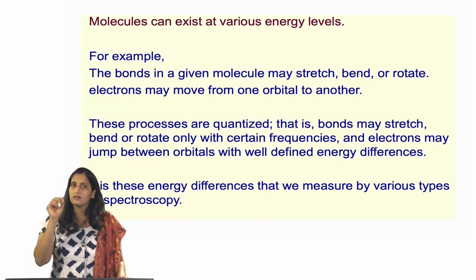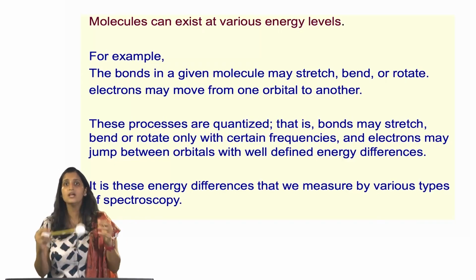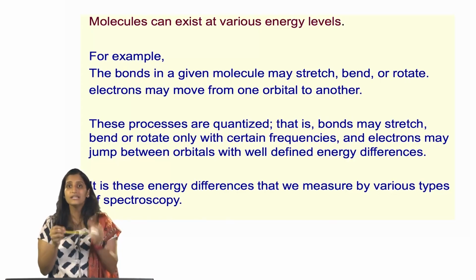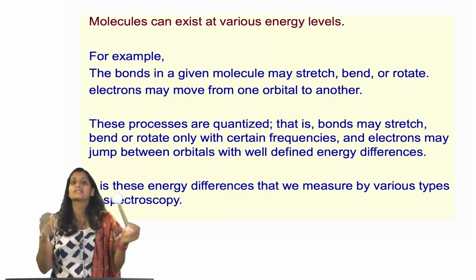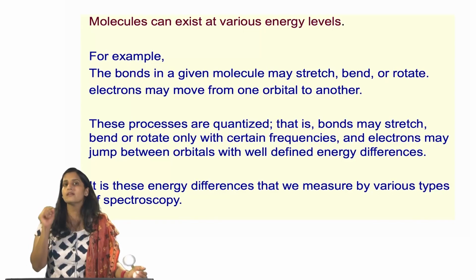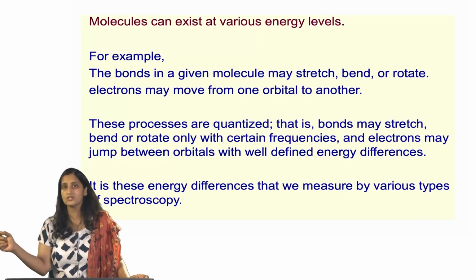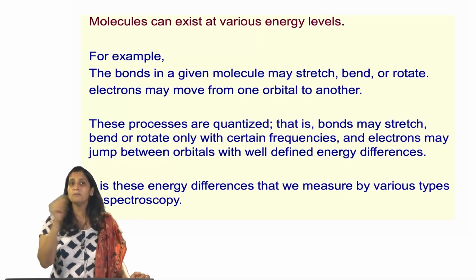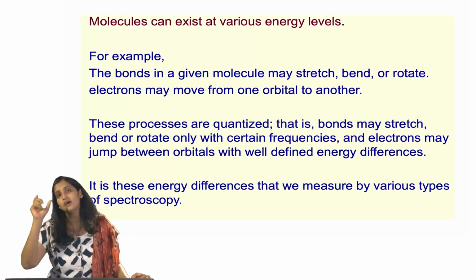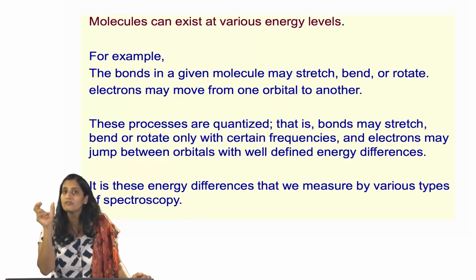And depending on, let us say you take a molecule, you shine light on it, you give it energy, how did the bonds in this particular molecule, or how did the electrons in this particular molecule start vibrating, rotating, stretching, bending, right? All of these things we can measure with the help of the energy difference. Because remember, when we talked about E equal to h nu, the frequency is going to be proportional to that energy, right? And depending on how much is the change, the energy difference, we can really understand what kind of bond is present.